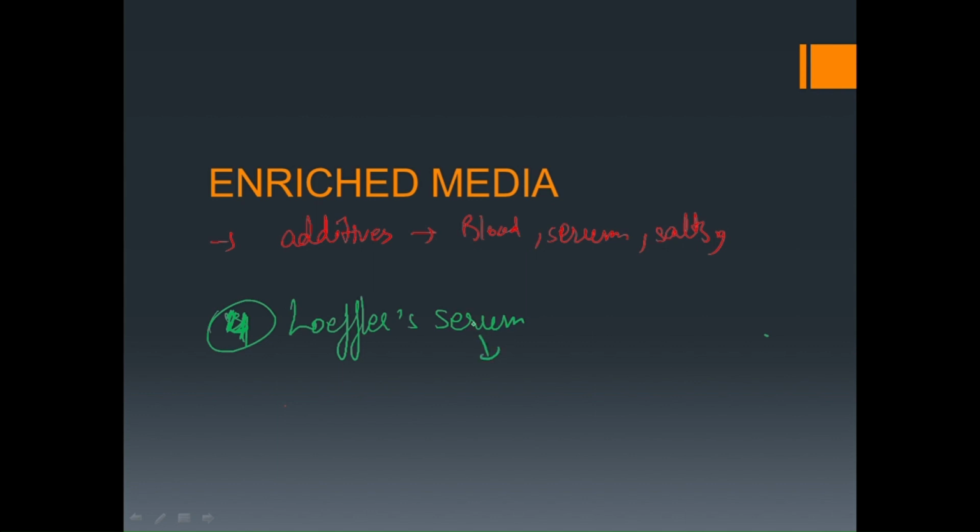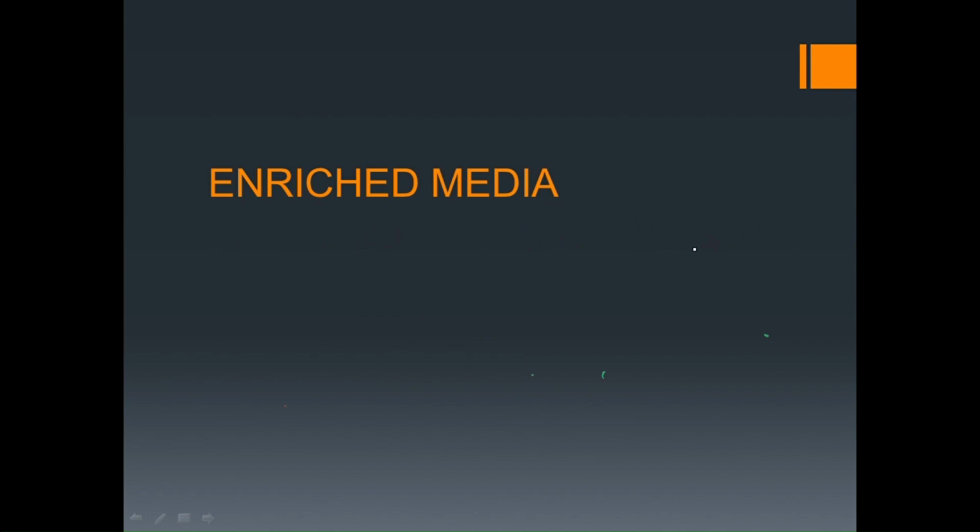Now, Loeffler's serum is a special media which is used to grow Corynebacterium diphtheriae. It contains serum as enrichment. This Loeffler's media is enriched with blood serum, so that Corynebacterium diphtheriae can grow in it.